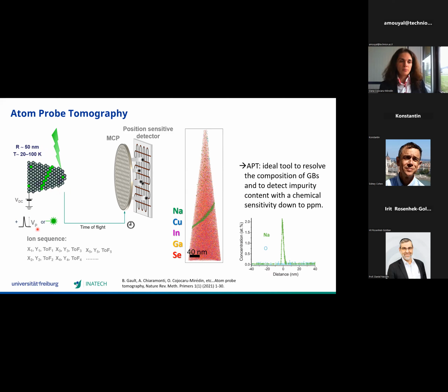What we apply in addition, and this is crucial for the atom probe, and basically this defines the two modes in which the atom probe can be used, is electric pulses and laser pulses. I schematize here the laser pulses because I'm mainly working with semiconductor materials, and they require, of course, a laser, as voltage pulses will not be sufficient.